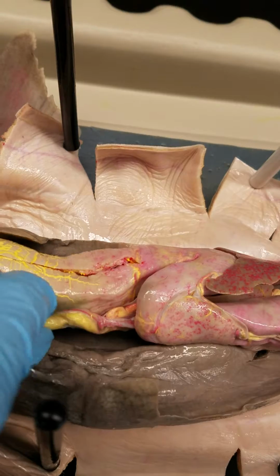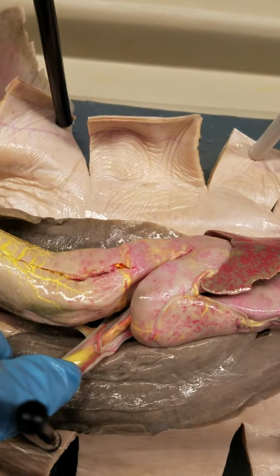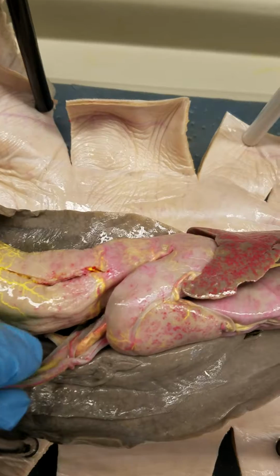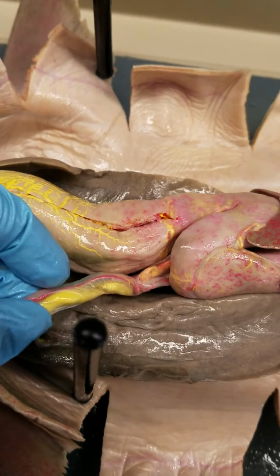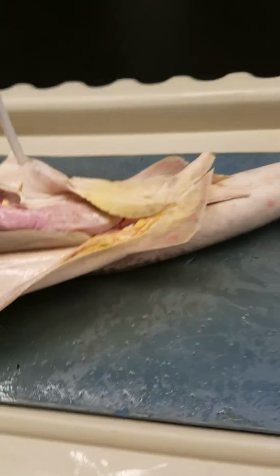So in this mass of nerve and veins, you can kind of see the connective tissue there, which is going to be your gastrohepatoduodenal ligament, which kind of envelops. You have your bile duct, and then you have blood vessel, and you have a nerve here, and it just envelops all of it in this little bundle.